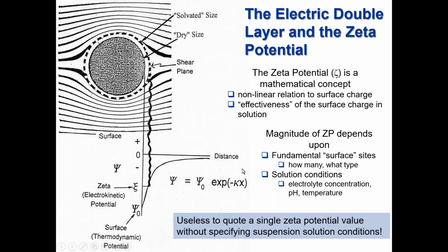At the simplest level, the sign and magnitude of Zeta potential can help maintain a more consistent product, and at a more complex level, it can improve product quality and performance. At the very least, its measurement answers the question, is the electrical charge on the material positive or negative? This information is often enough to suggest further steps in formulation and processing. The next higher level inquiry has to do with quality control. Has the product sufficient electrostatic repulsion to maintain its stability?